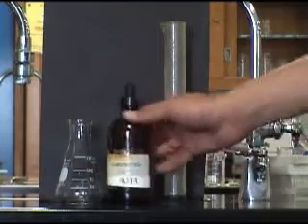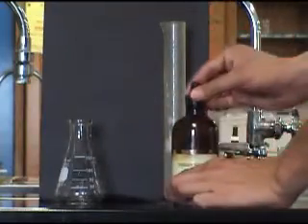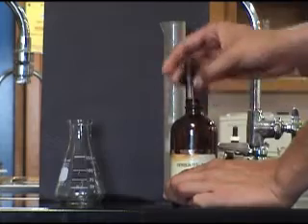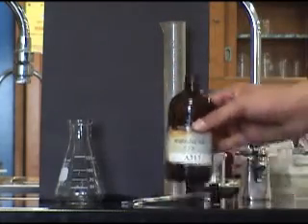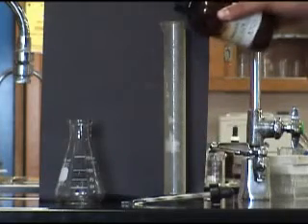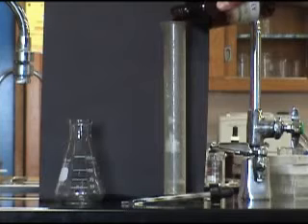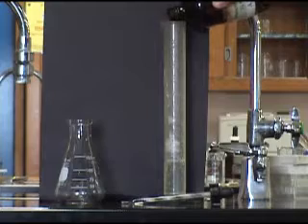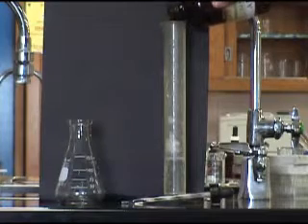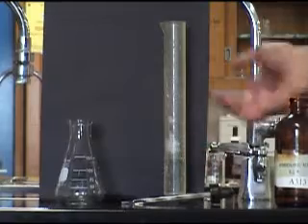Taking hydrochloric acid, measure out the desired amount that is needed to titrate. From the graduated cylinder, pour it into a flask.